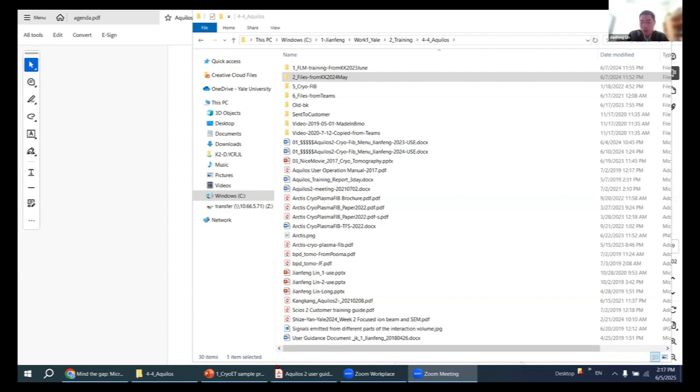But in reality, when I do my experiment, I also pay attention to the thickness. I do cryo-electron tomography and look at the cross section, and that gives me some idea of how severe the ice contamination will be. Okay. So yeah, if I heard correctly, you mentioned 20-30 nanometers in a couple of hours.